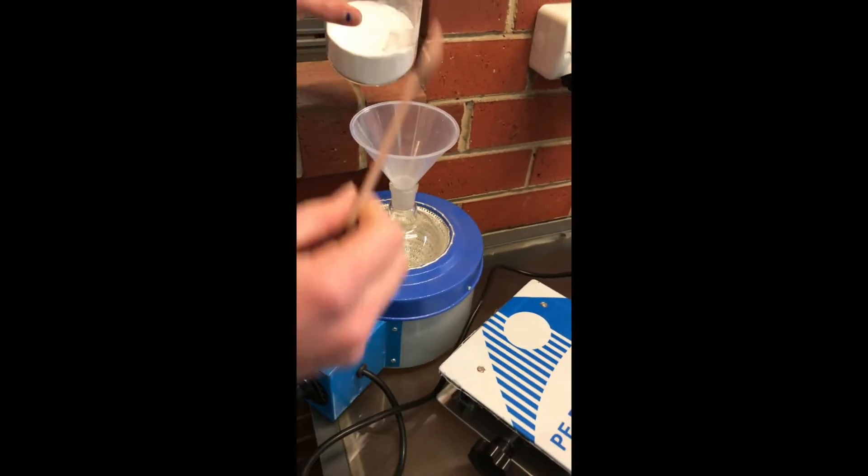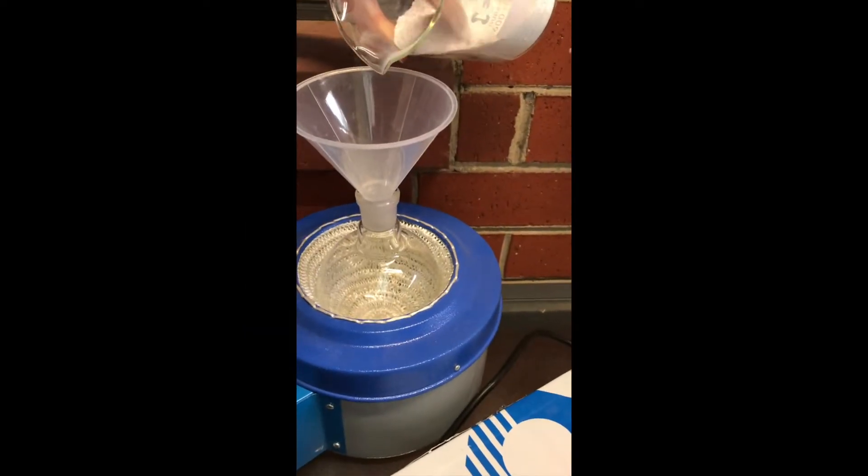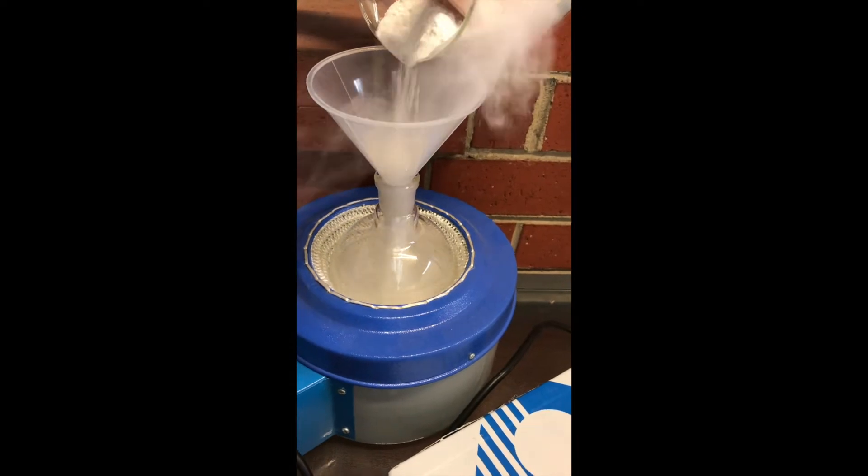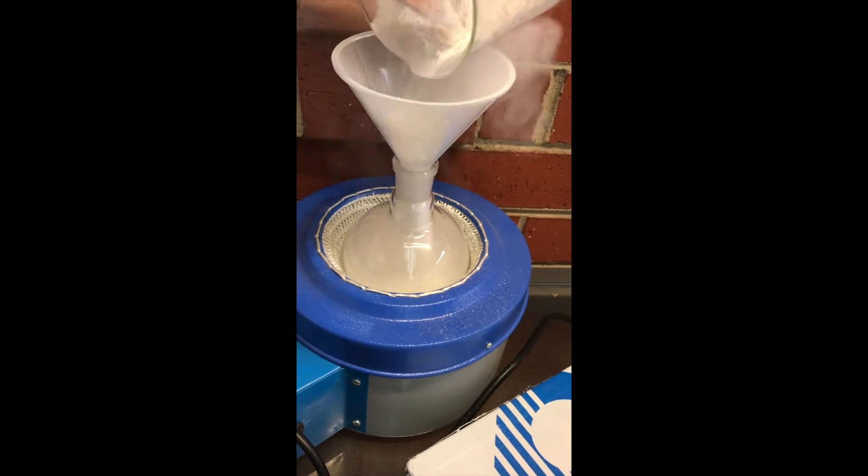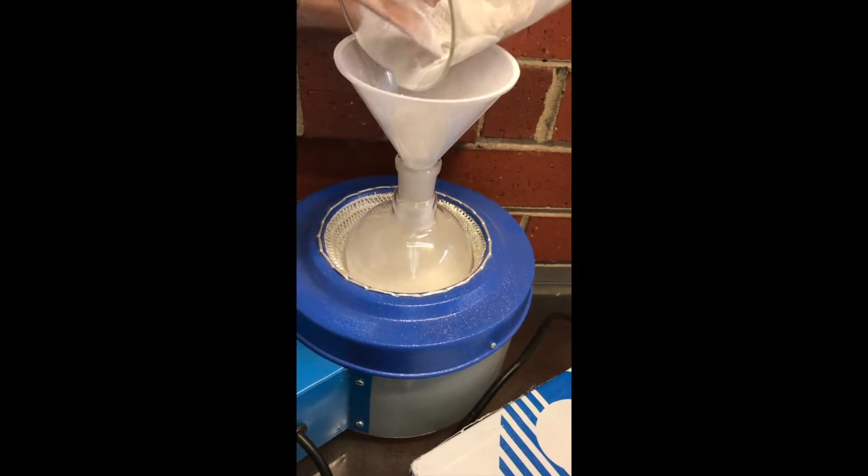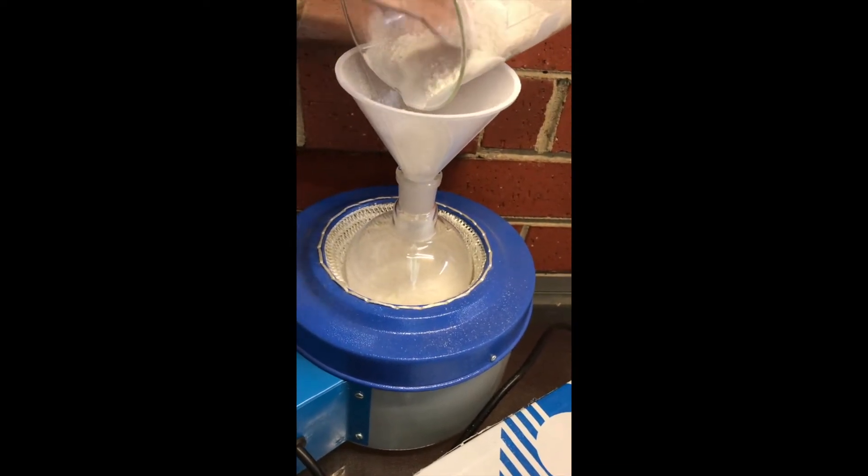Firstly, before I set up the condenser, I pour 93.98 grams of anhydrous calcium acetate into a 500 milliliter round bottom flask. Whilst pouring the calcium acetate, I should have been more careful there, as I probably lost a few grams.